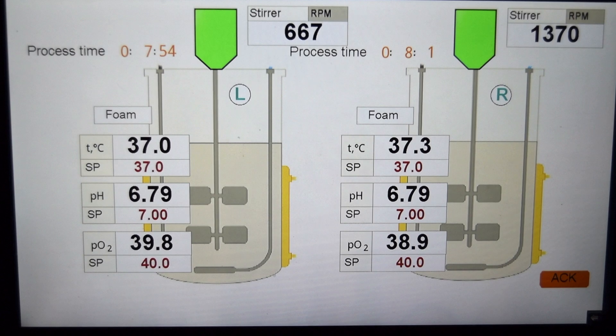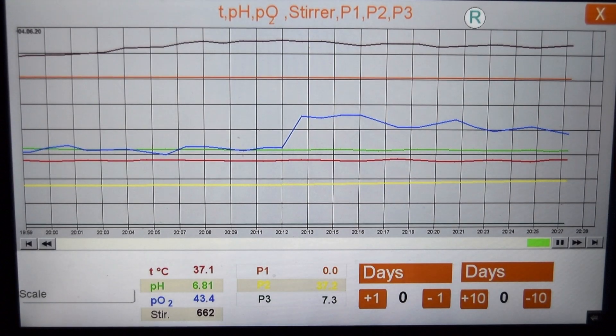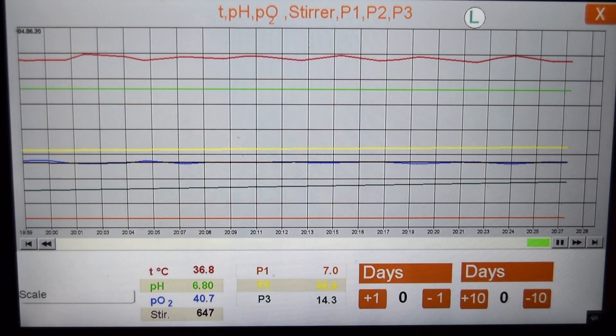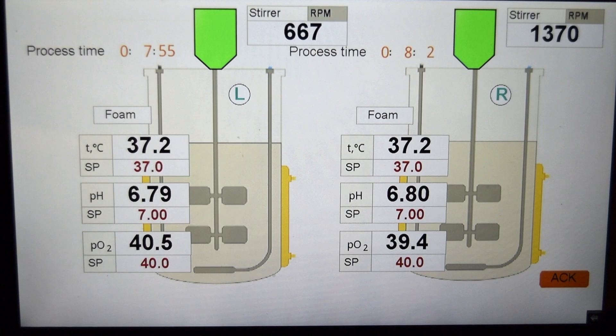Now on this display you can see how the process is progressing in both vessels. It is 8 hours of fermentation. Here you can see the trends of the glucose-fed fermentation, and here the trends of the glycerol-fed fermentation. At this moment in the glucose-fed fermentation biomass is about 6 grams per liter, but in the glycerol-fed fermentation 4 grams per liter. The fermentation is not yet finished.